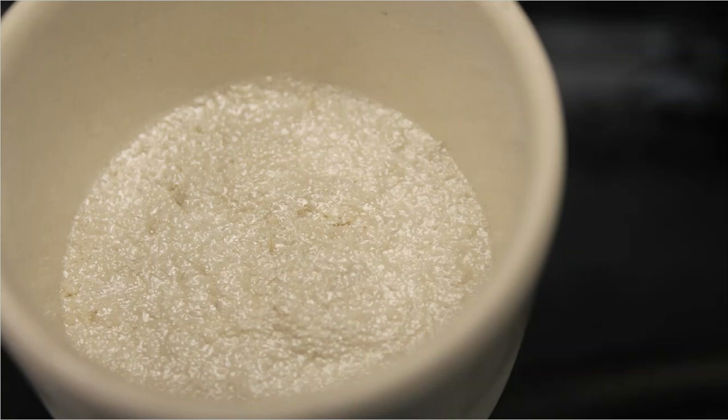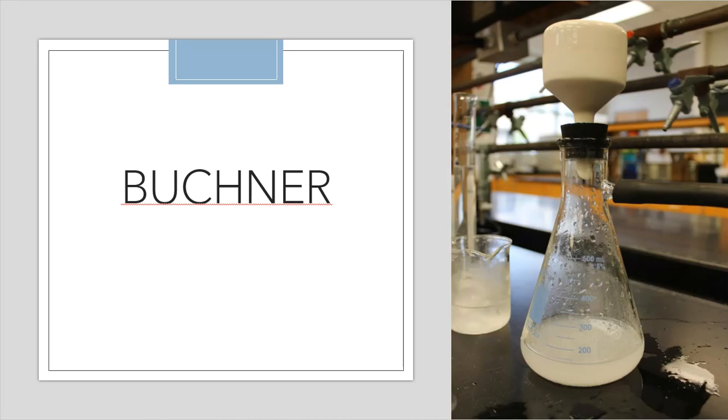Again, I had to pour that through a Buchner funnel. So that's what my filtrate looked like. And it's cloudy, but I was not alarmed, and the reason is because I didn't see any solid formation. My filtrate can be cloudy. My filtrate can be colored. That's not a problem. But if I see solid formation in the filtrate, then I know that I didn't give it enough time. That's why I'm okay with this one, and I wasn't okay with the other one.